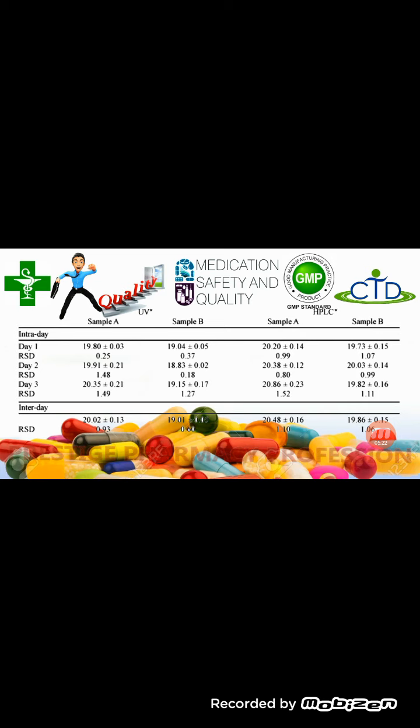Precision is best when we want to choose a UV spectrophotometry method instead of HPLC. This is because we compare the results of UV with HPLC and consider a method validated if its relative standard deviation stays within limits. Please have a look on the screen for the table where a comparison of successful precision concept is shown among Day 1, Day 2, HPLC and UV Day 3. The limits of relative standard deviation vary from analysis to analysis, especially in case of impurities study profile.